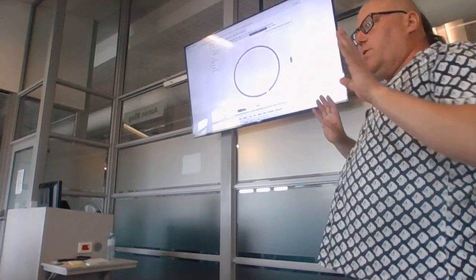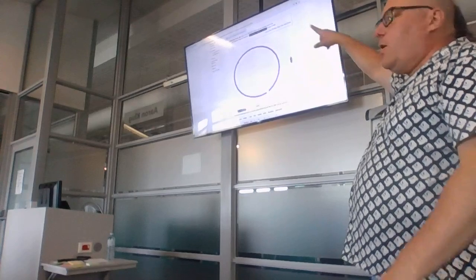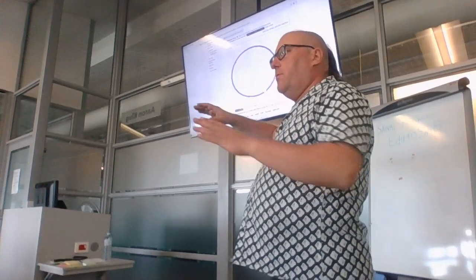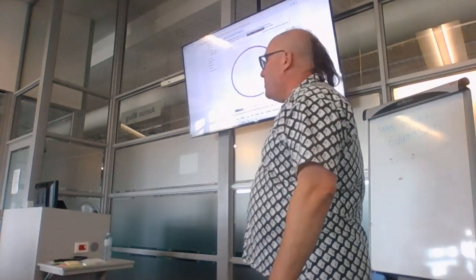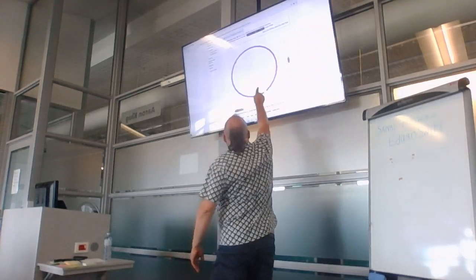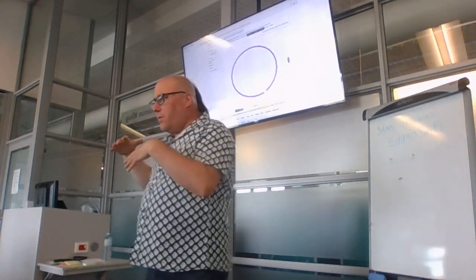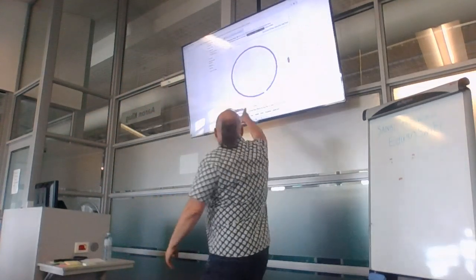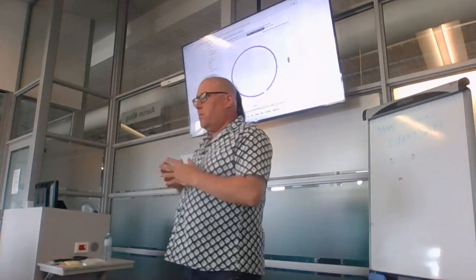But before you get very excited about nanopore reads, the nanopore reads allow us to generally cross the repetitive regions and assemble things together. But until recently, if you look closely at this assembly, you would find that there are mistakes at the small level because nanopore is not very accurate. So the individual bases inside of here, the structure might be right, but the individual bases might be wrong. Okay?